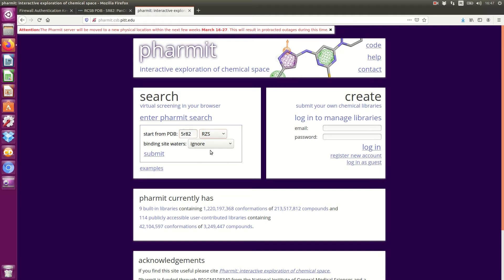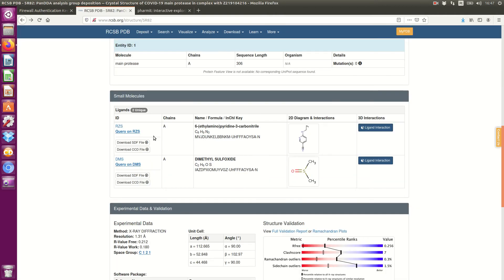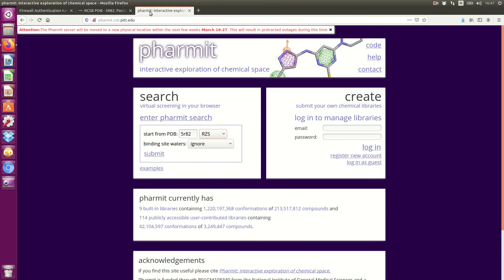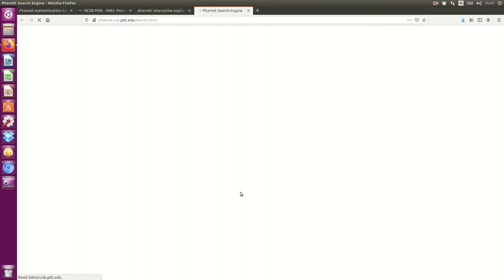Refresh. Here, this is the ligand. As you can see, it has the same code as the ligand. And now I submit.